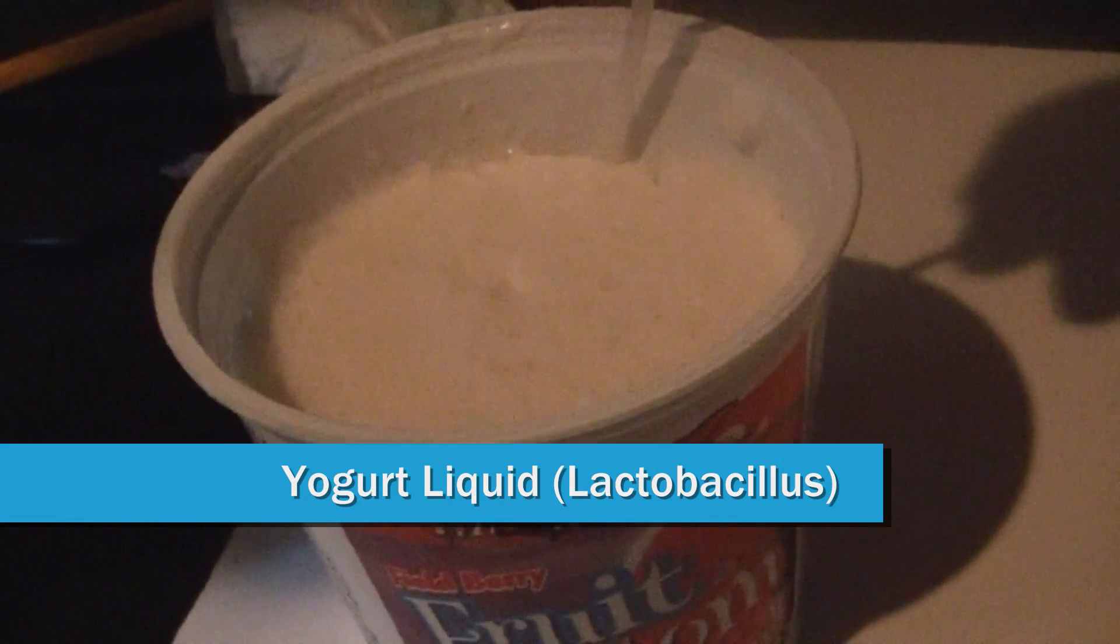Next up is a yogurt that I kind of forgot about at the back of my fridge past the expiry date. I take just a small sample of the liquid off the top of this yogurt. In this droplet, we find lactobacilli bacteria. These are the organisms that are actually responsible for making yogurt out of milk products, instead of cheese or something else. These bacteria tend to cluster in pairs and chains and float around as a group and colonize in groups. These individual cells themselves tend to be on the order of one and a half to two micrometers in length. Although these numbers are similar to the thinner spider silk we saw, these are really too small to actually see normally. The only reason we can see the spider silk effectively is because it's very efficient at scattering light.